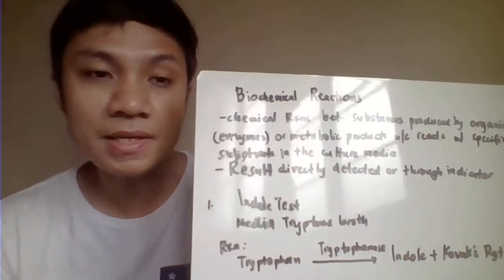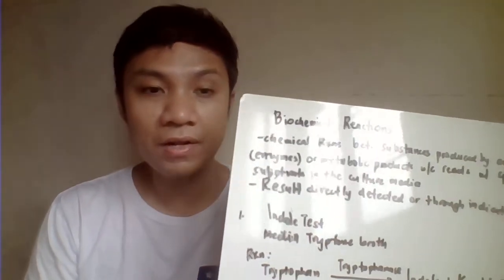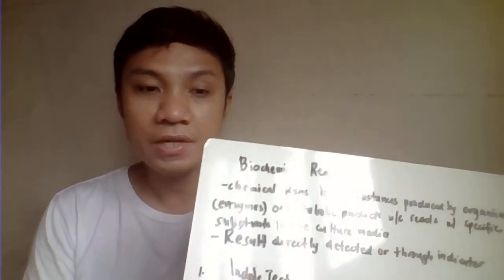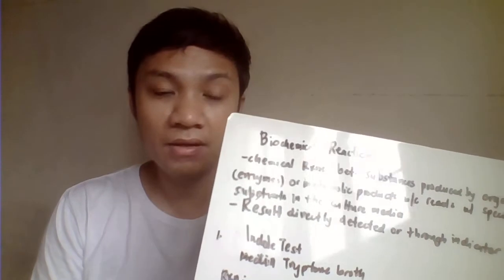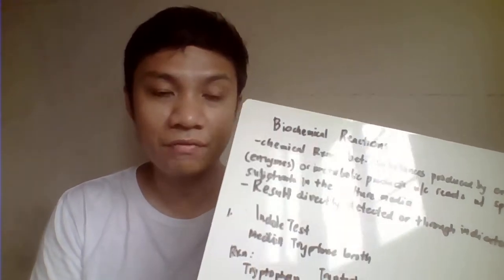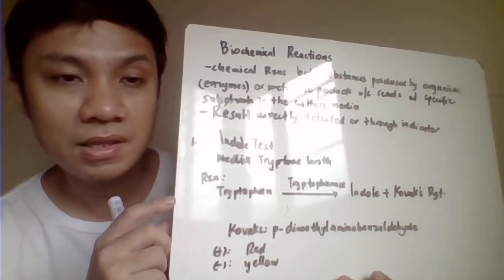So we'll be discussing here the basic principle and the different culture media utilized for each of the biochemical reactions and even the end product. Okay, let's just simplify the discussion for this. The first test here, we have the test for the indole.